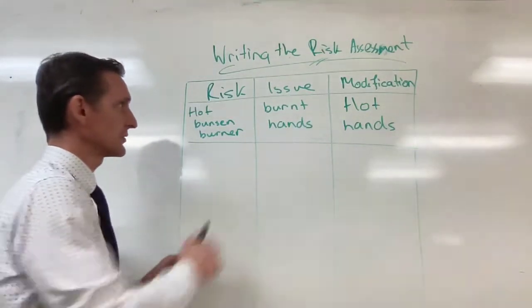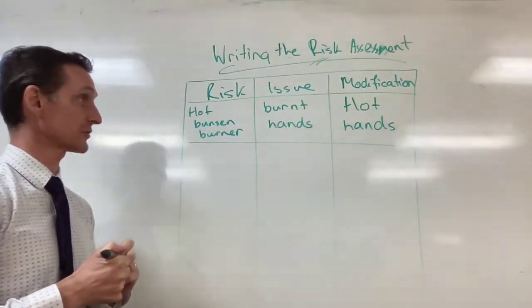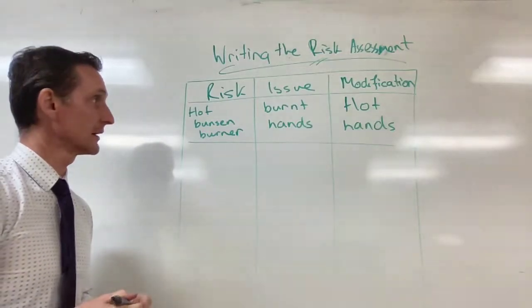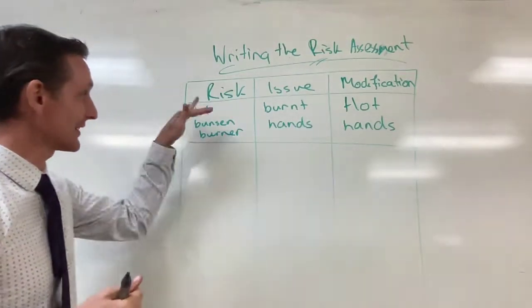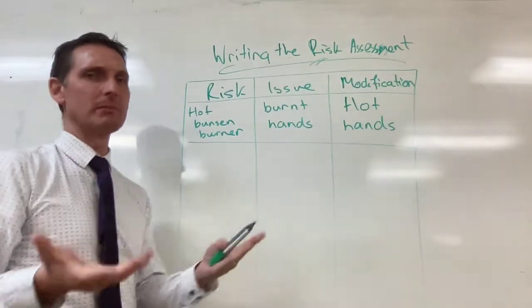Some of them you might need to explain if it's not self-explanatory, but most of the time I, as your reader, need to know, and as you are doing the experiment, I need to know that you're going to be safe and you've identified a number of risks. Now they might be very simple and a bit boring.